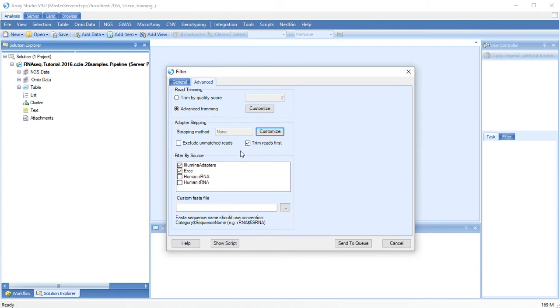Adapter stripping is especially important when the library read lengths might be longer than the fragment size. You can also control the order of operations between trimming and stripping.